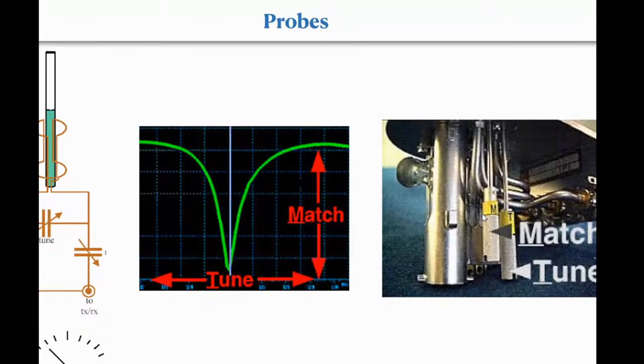So we tune and match by turning these knobs. In the old radios, we also have to get into AM and FM because of different frequencies, and then we have to tune the radio such that you match the right frequency. When it's the right frequency, it is ready for resonance. Okay, so that is what happens. So you have to tune and match. What are we tuning and matching? We are tuning and matching the resonant coil frequency with the 600 or 500, whatever the resonance frequency is for the nuclei.